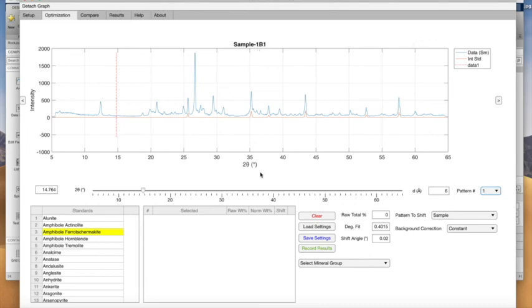Anyway, this is analogous to, say, if you were analyzing the mineralogy of sediments in a core that you collected. You have sediments in the same area, but due to different climatic factors and so on, you might have different proportions of the same minerals in different layers. So that's a good reason to load them all at once, try to get the same analysis working for all of them, and then report the results for all the samples based on analyzing for the same minerals.